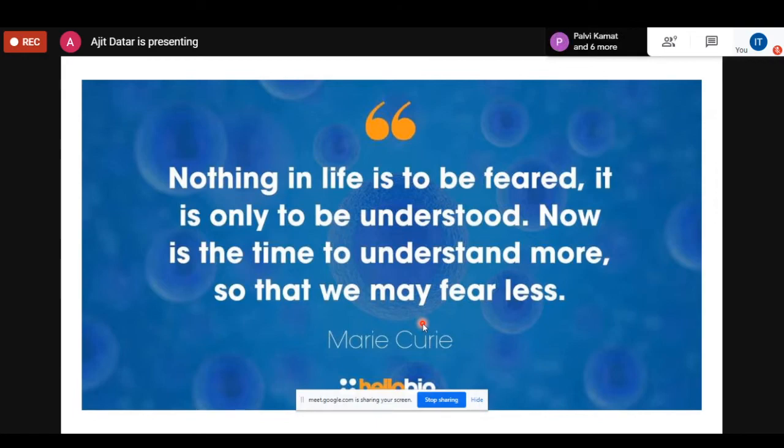Is dioxin detected in milk and milk products in our country? Yes, it is done today. There are two types of instruments, as I said. There is a high resolution magnetic sector mass analyzer connected to GC, and this facility is at the Export Inspection Authority in Chennai, and also with Vimta Labs in Hyderabad. These two facilities I know very well, and people are now trying to use the quadruple GC-MSMS technique. And we, as Shimadzu, have this method available with us.